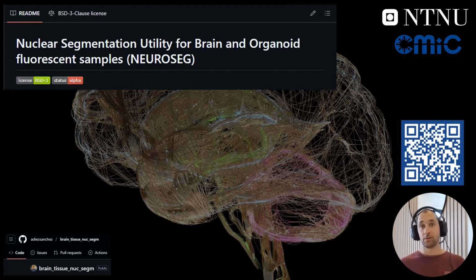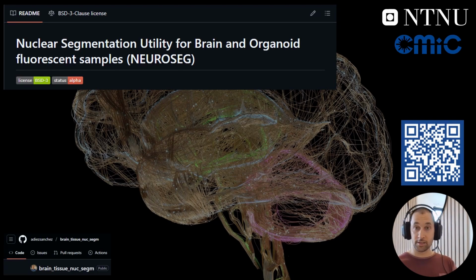Hi everyone. So this video is meant to showcase the image analysis functionalities of this collection of interactive Jupyter Notebooks, but also to save me some time in terms of training the people that are using it. We at CEMIC, the Cellular and Molecular Imaging Core Facility at NTNU, have seen that this notebook collection covers many common image analysis needs and wanted to share it with the rest of you.